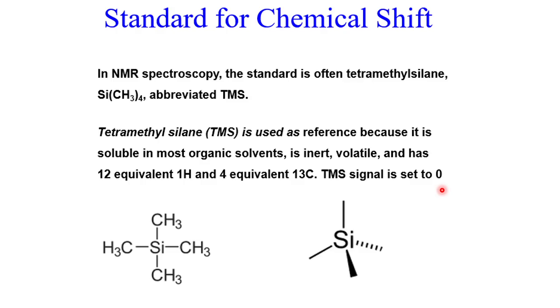In solution state, a specific NMR solvent must be used. For example, CDCl3, that is deuterated chloroform, CHCl3 with almost all protons substituted by deuterium. Then another one is D2O, that is heavy water. Also DMSO-d6, that is deuterated dimethyl sulfoxide. There also you are substituting the hydrogen by deuterium. So these are the most common NMR solvents used for solution state NMR.